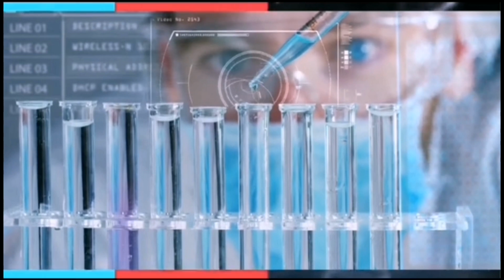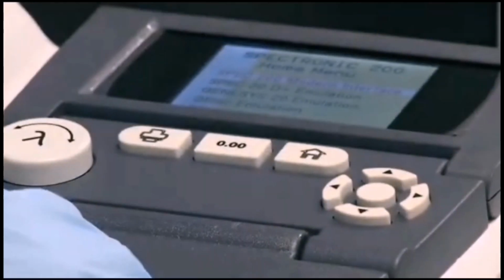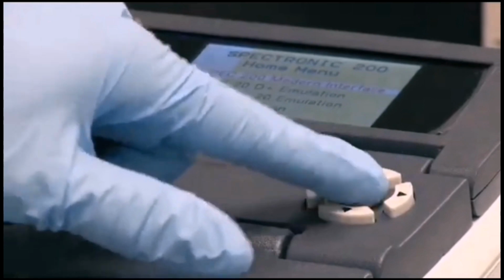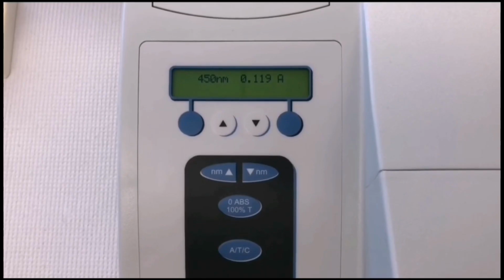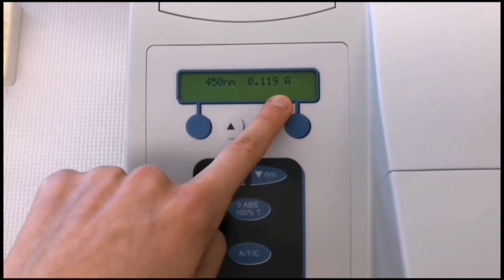And after that, I will now discuss how to operate the spectrophotometer. First, power on the spectrophotometer. Plug in and power on the device, allowing it to warm up for 5 to 15 minutes depending on the model. Second is select the wavelength. Find the wavelength knob and rotate it to set the desired wavelength. Different compounds absorb light at different wavelengths, so it is essential to choose the appropriate wavelength for your specific experiment.